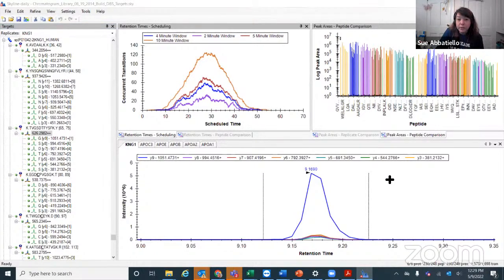If I can go through the questions, how does utilizing multiplexing influence detection of low-level peptides? So if you use multiplexing and that peptide is not present in all of your samples that you've combined, or it's very low abundance in some of your samples, but high in perhaps the carrier channel, you will be able to still identify it. And then the quantification from the reporter ion will allow you to get a sense of where it stands relative to all of the other samples that you're multiplexing with. If you did label free, it may not even have been triggered for MSMS, so you would never have identified it. So that's one of the main benefits there.